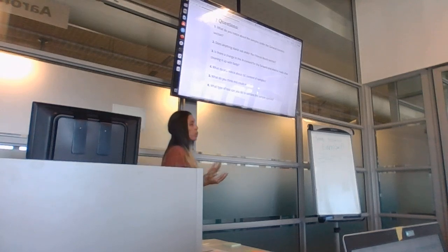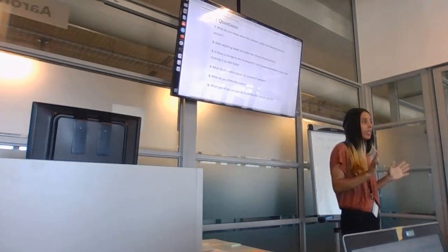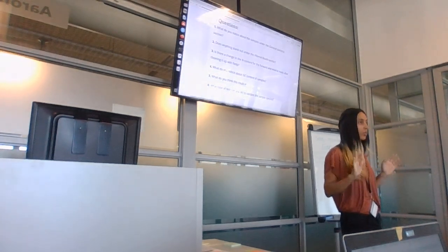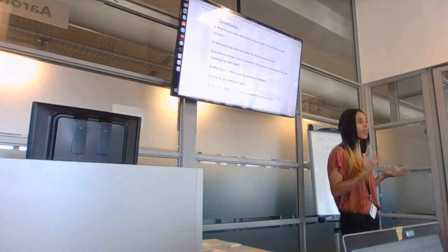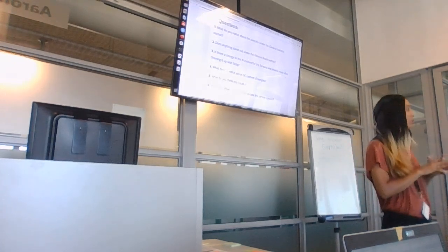And see if you can guess which output file you need. You don't have to get it right the first time around. Sometimes you have a whole bunch of output and you click through every one to figure out which one is giving you meaningful, interpretable results. So you can click through your files, look at what's inside of there, and see which one you want to use.